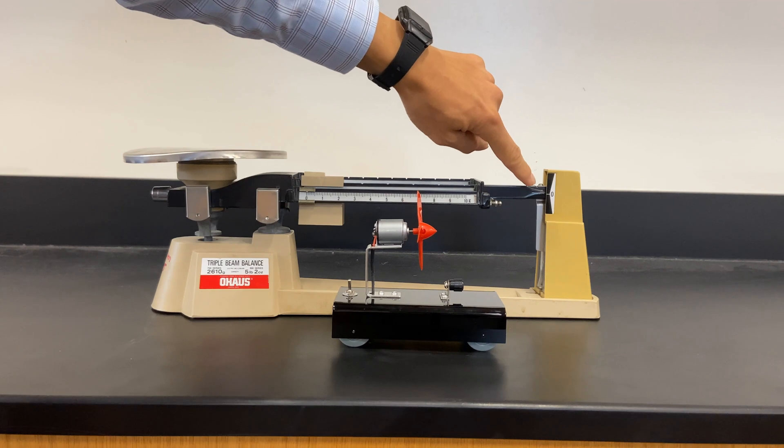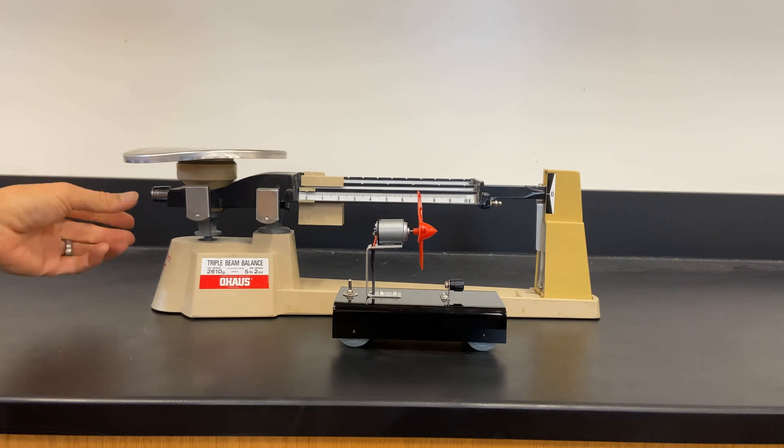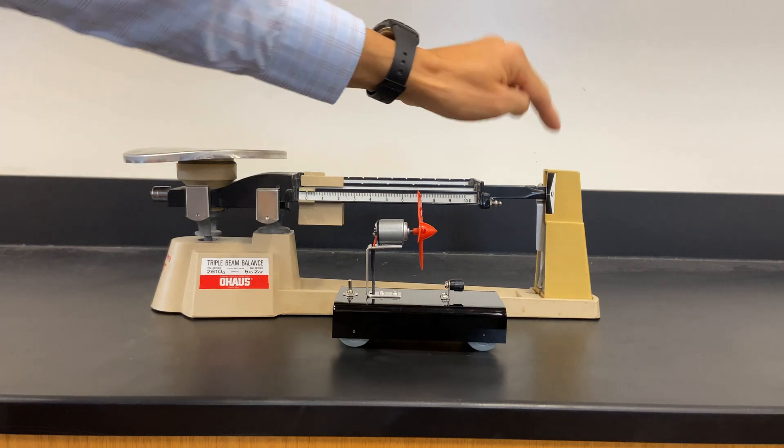To start, you want to make sure that the pointer is pointing to zero. If it's not pointing to zero, there's a zero adjustment knob that you can rotate right here so that it points to zero.